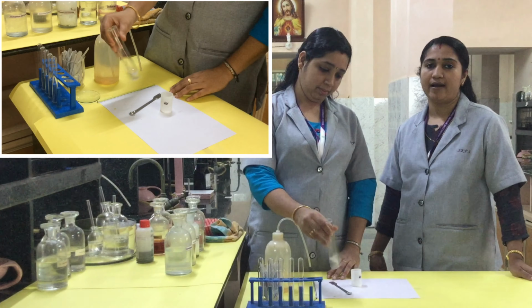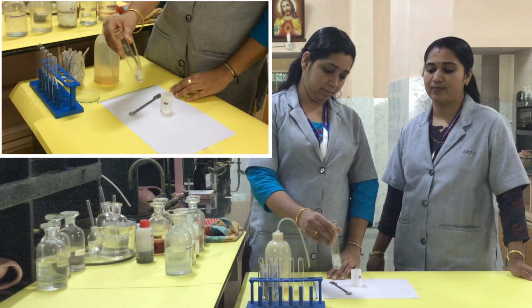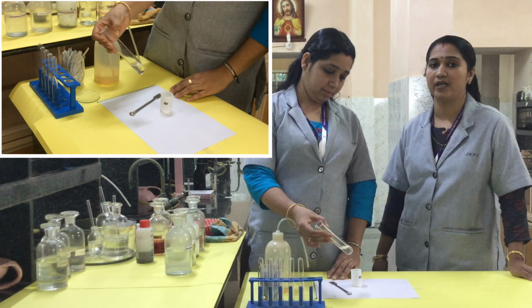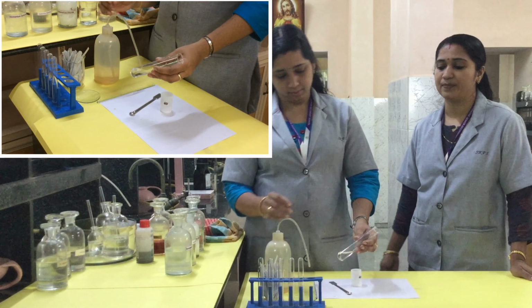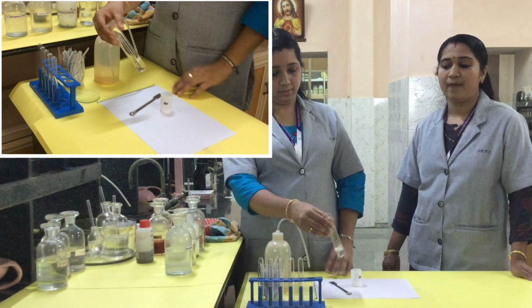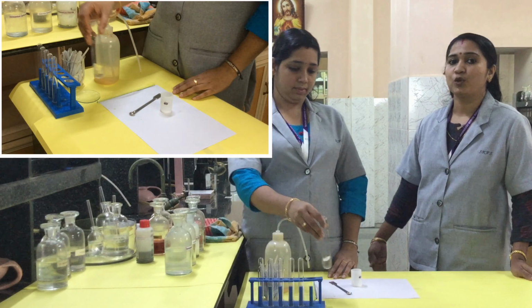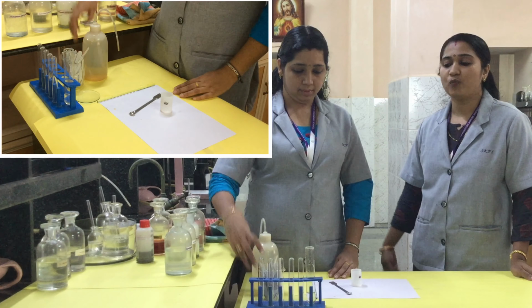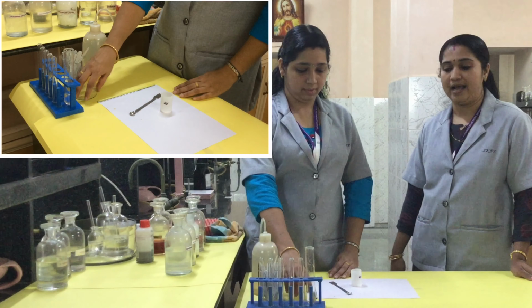In group 0, we are analyzing ammonia. Then group 1, lead. Group 2, we are not doing the experiment. Then group 3, we analyze the presence of aluminium. Then group 4, zinc. Then group 5, barium. Then group 6, magnesium.